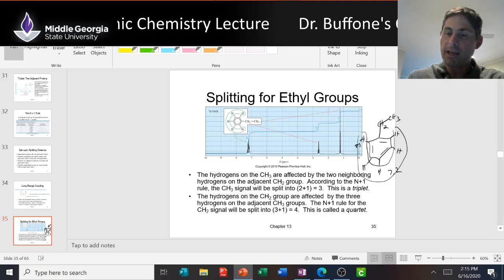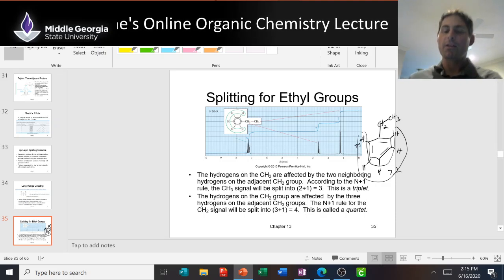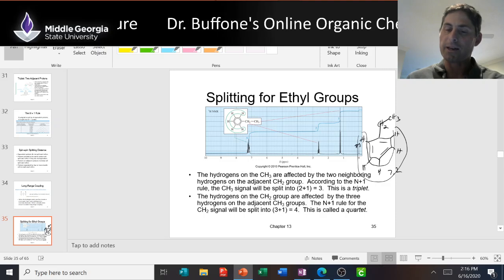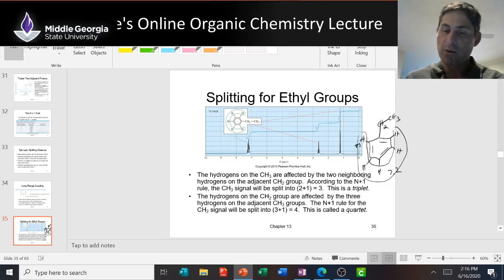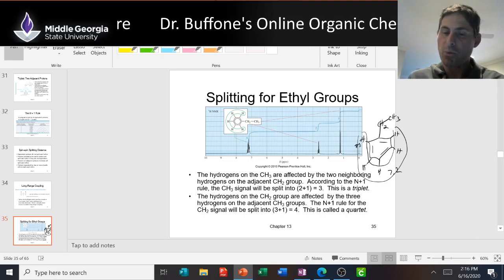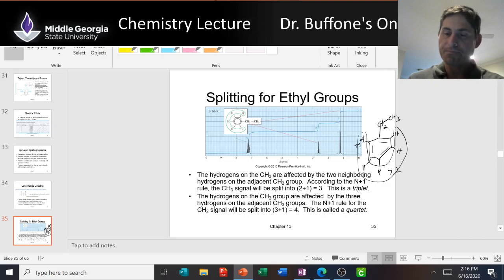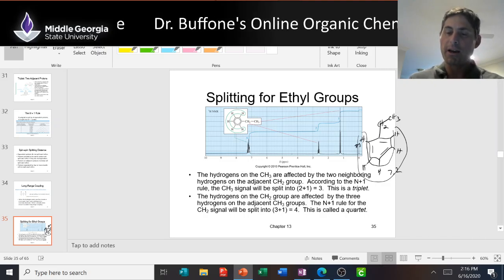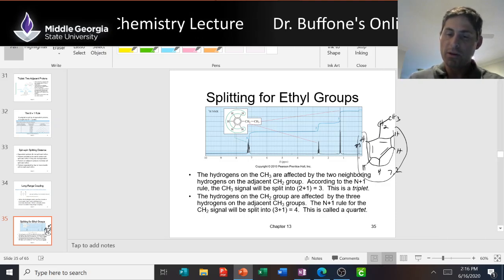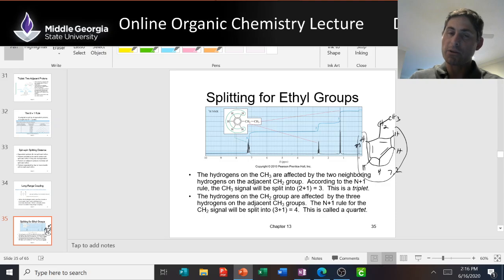What about the methylene? It's attached right on that aromatic ring, so it is de-shielded a little more than it normally is, right? So the methyl is close to 1, but it's kind of de-shielded because it's close to the aromatic ring. So it goes from 0.9, where it should be, to like 1.2 because it's slightly de-shielded. The methylene should be at like 1.3, but it's way de-shielded because it's attached directly to the aromatic ring, and anything on that aromatic ring is de-shielded, right? Any protons on or close to the aromatic ring, these protons here would be in the benzylic position, so they would be de-shielded from their normal to about a 2.6 something. And they have 3 proton neighbors, so 3 plus 1 is 4.